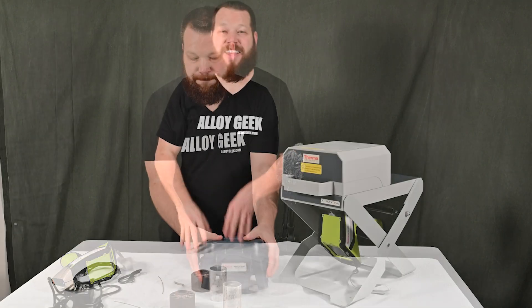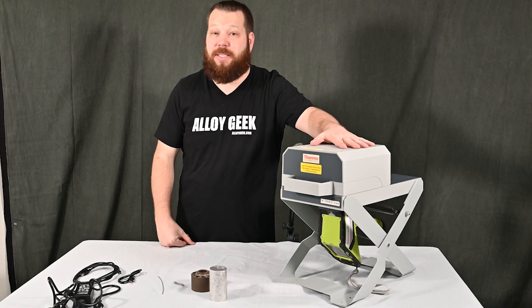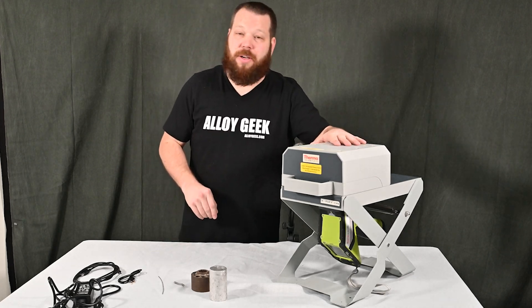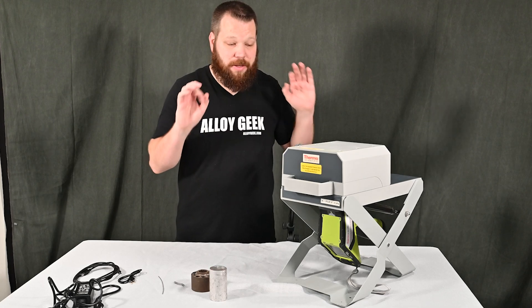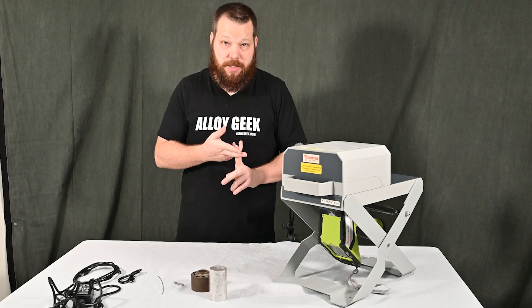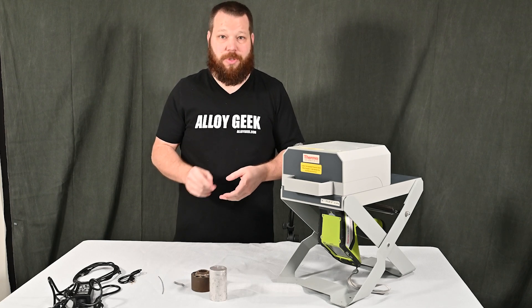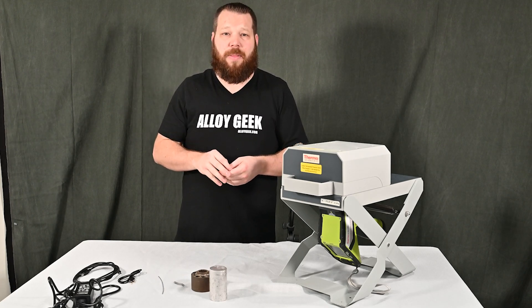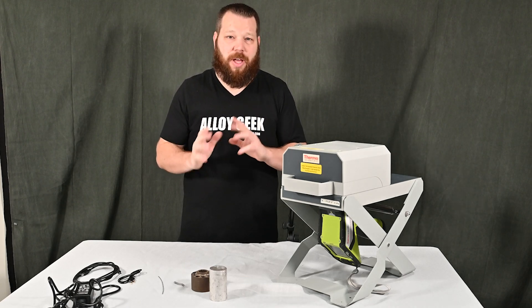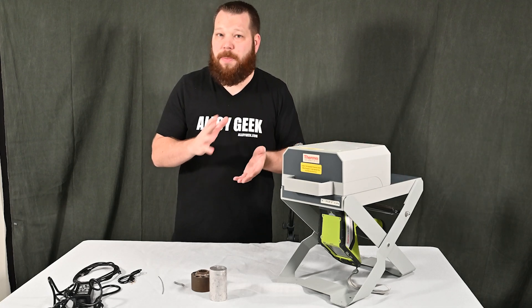Now here we have the portable test stand by Thermo Scientific Niton. This is a pre-owned test stand — you can buy one on AlloyGeek.com. They're great, they last a long time, they're pretty rugged and robust. You can also buy a new one there, and we offer to set up a computer with NDT software for your analyzer along with a virtual training to get you set up with your test stands if you need them.